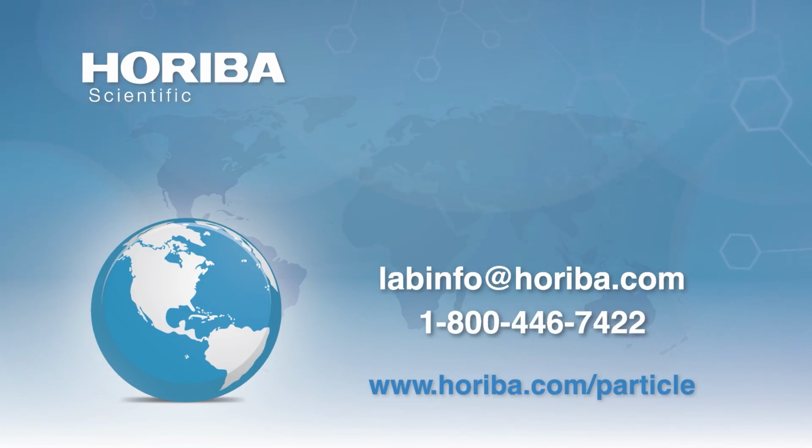If you wanted to do something like that, probably the best way to try to do it would be with the line start, because there you're going to separate your particles. Typically, at least those emulsions that I've seen have been a little bit too high in concentration. And so if you tried to do it homogeneous, you would end up having too much light obscuration and you couldn't make your measurement.